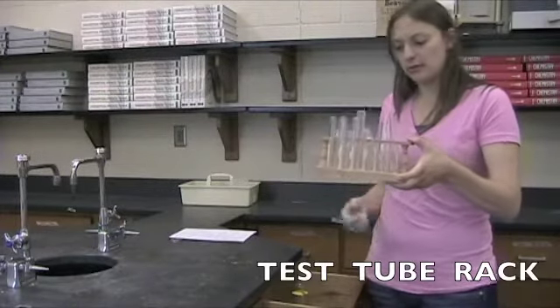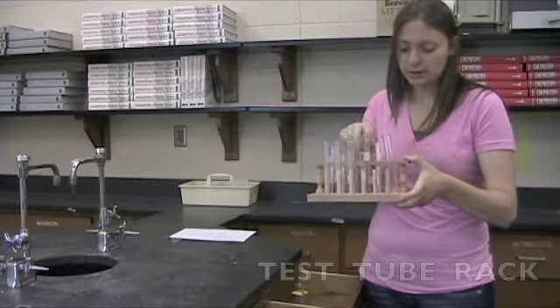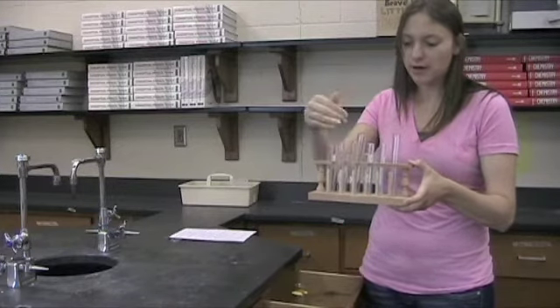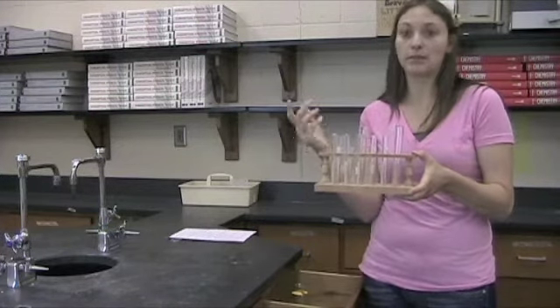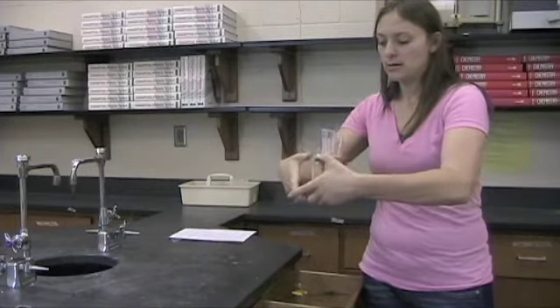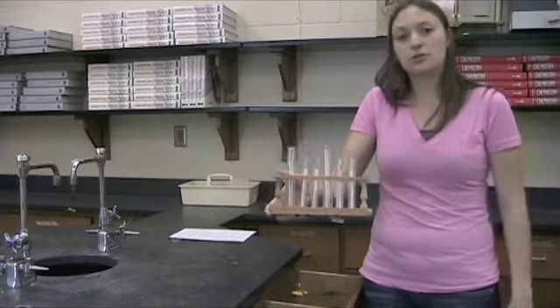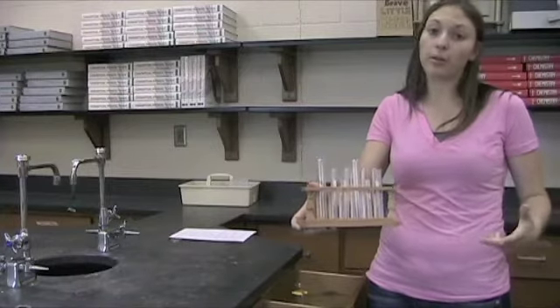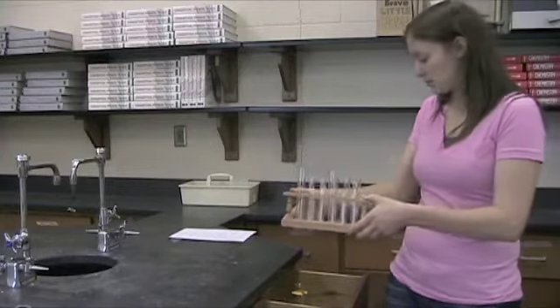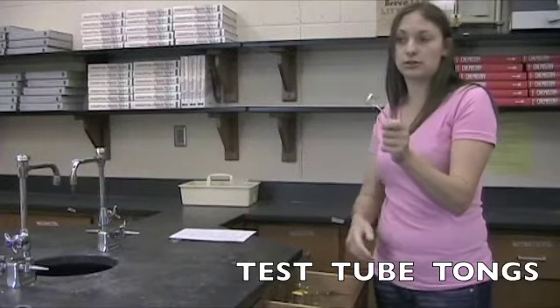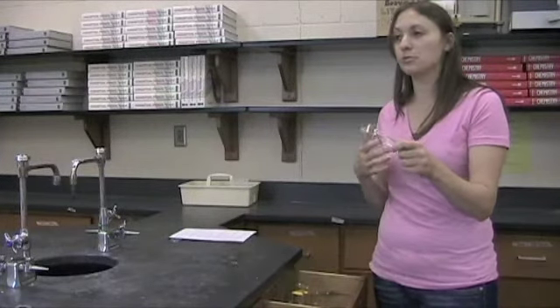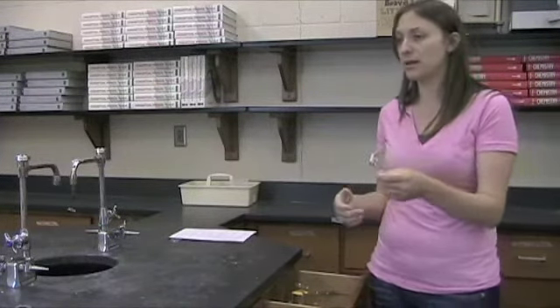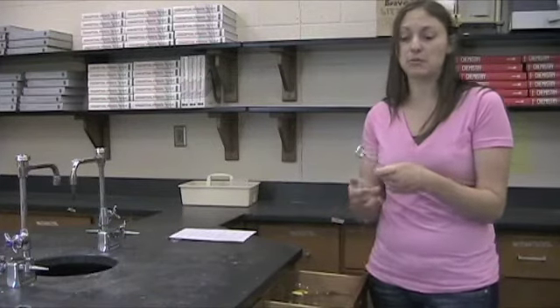We also have a test tube rack. This is what holds all the test tubes. As you can see, the ones on the outside there are upside down. That's kind of to dry them out. The side that is now closest to you is really used more to hold them. I can look at the different colors. I can kind of compare them and they're all going to be side by side. These are test tube tongs. They are used to hold test tubes over small flames. You can move test tubes if I can't touch the test tube for some reason. It's got something in it that I don't want to spill on myself. All I have to do is just push on the sides and they open.